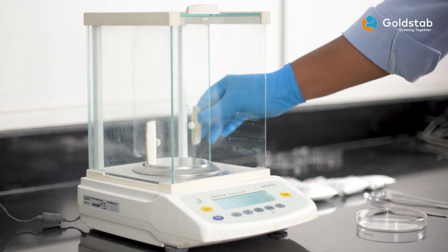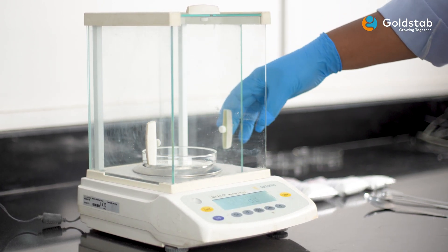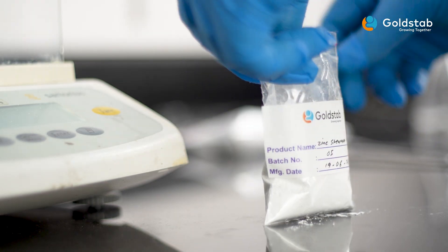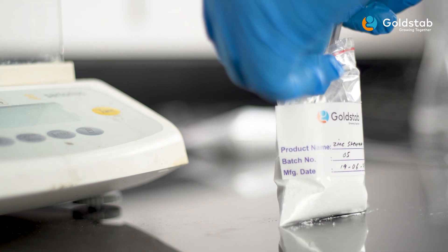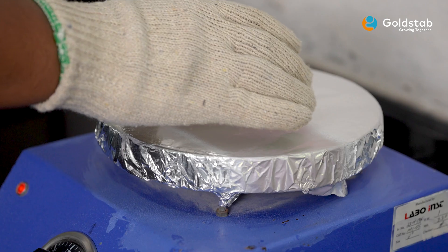Step one: Take a glass petri dish and ensure it is clean and dry. Weigh about 5 grams of zinc stearate. Step two: Set the hot plate for heating up to 150 degrees centigrade.